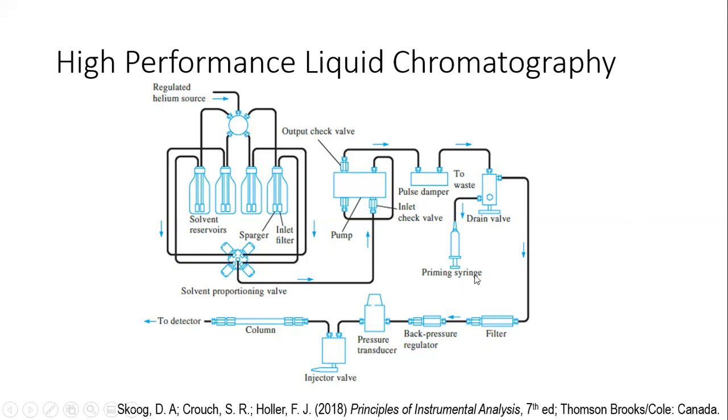And this one is for priming, for preparing or draining your column. Then you have here your injection port. Yung injection port, mas malapit siya doon sa column.